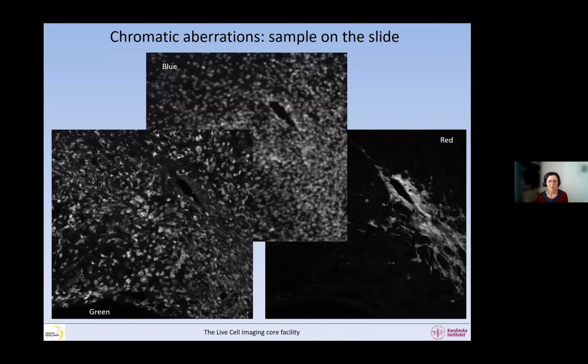Leonie, you're not allowed to answer. Anybody sees the problem? So these are the 3 channels. I've just split the channels and I'm showing them to you in black and white. I would say that blue and green is difficult to distinguish. Oh, sorry, because I put the blue image behind the green. I wanted to show you. That's why. But what do you think if you look at the blue and the green? The blue is not in focus. Yeah, exactly. The blue is not in focus.